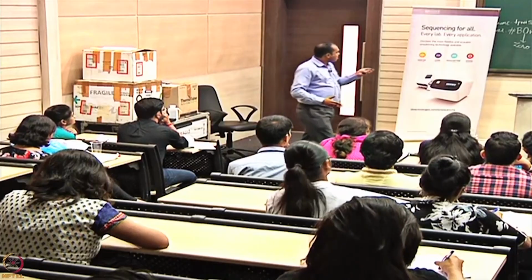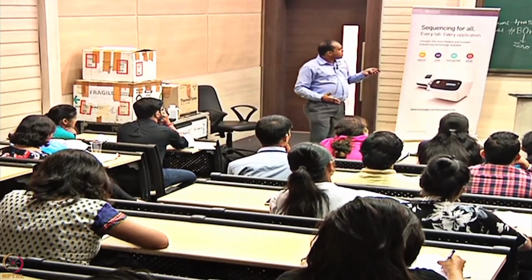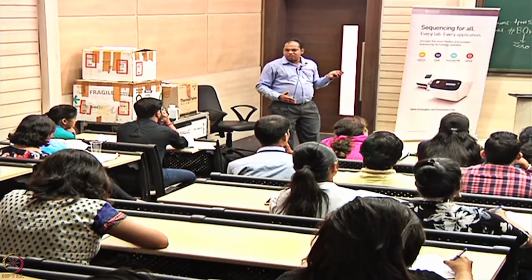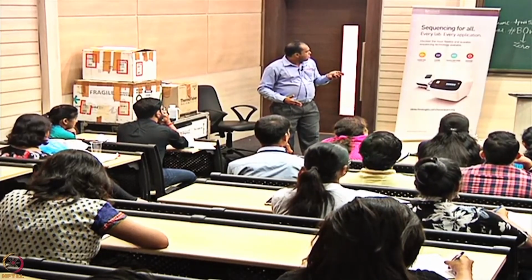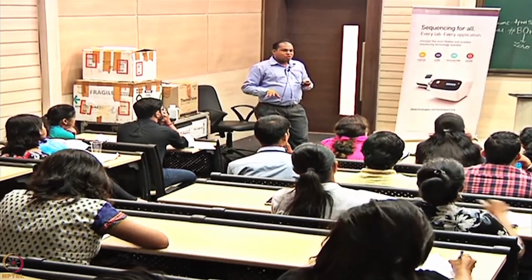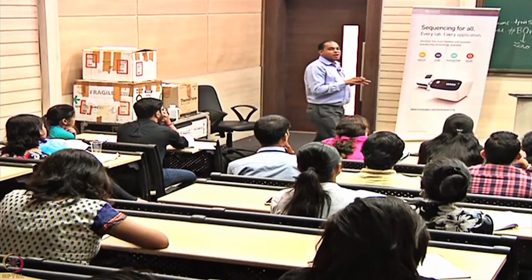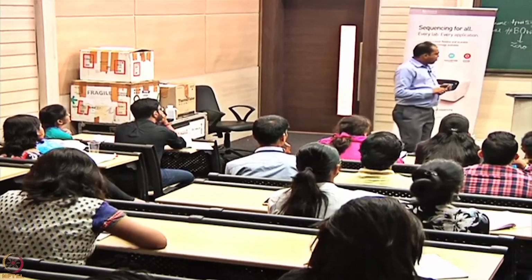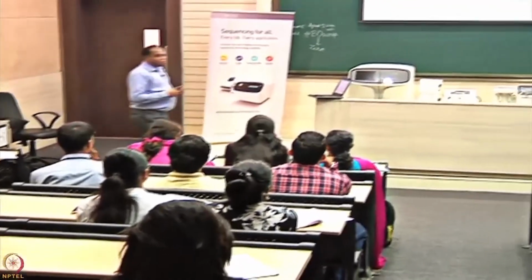Okay, this is just an example that I've put forward. One of the genes which has been aligned by the reads has the forward reads as well as the reverse reads in it. So in this way, we like to know whether the regions are getting covered or not, whether there is proper coverage at my gene of interest or not. Okay. So after this, what am I going to do going forward?